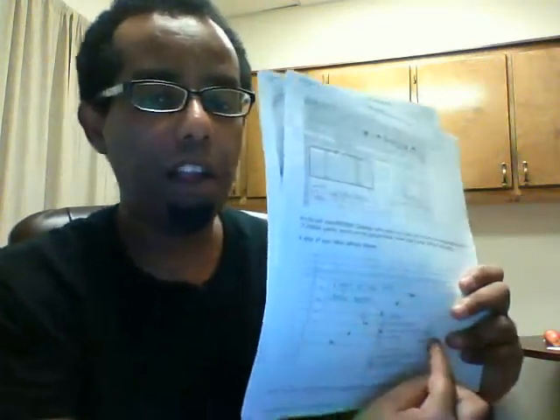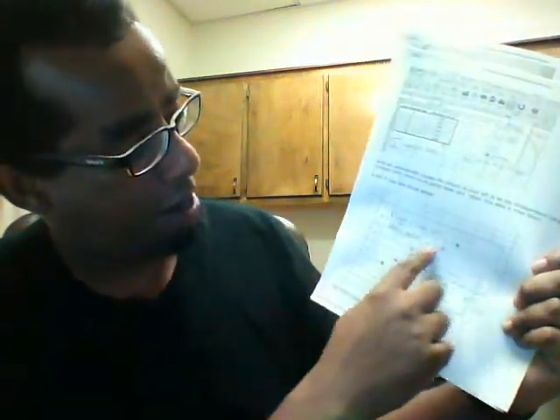Here, when you do this, what you're going to see is that your points are going to be scattered like this. Unfortunately, folks, your points are not going to lie exactly beautifully on a straight line like you see here. Some will be here, some will be here, and some will be there. So they are not exactly on a straight line. Things are not perfect in real life.